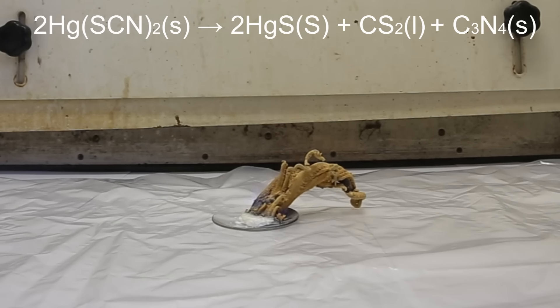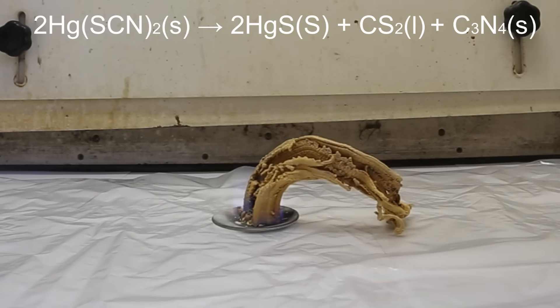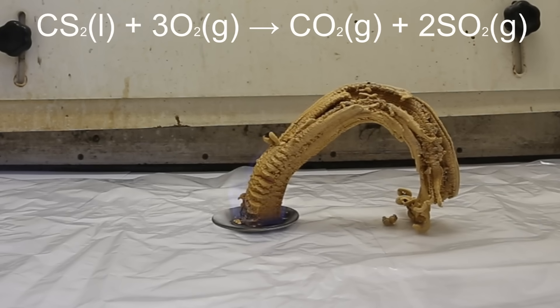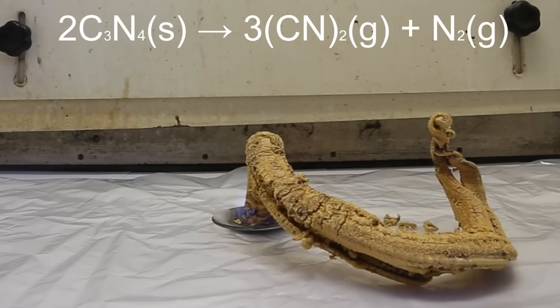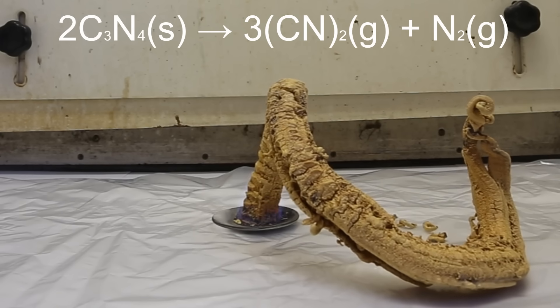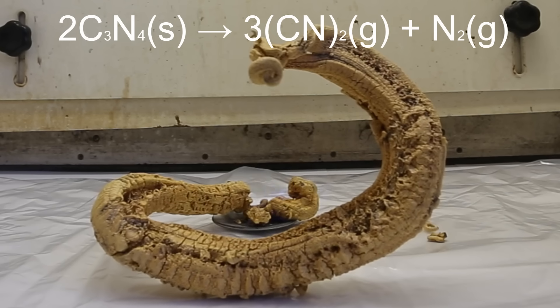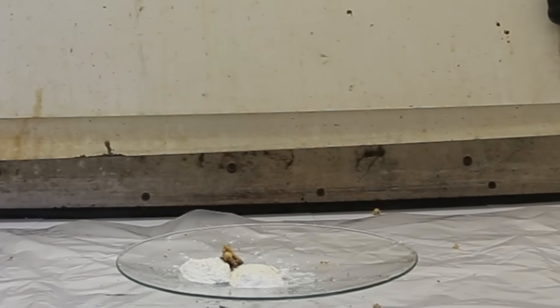Igniting the mercury thiocyanate causes it to decompose, producing mercury(II) sulfide, carbon disulfide, and carbon nitride. The mercury(II) sulfide readily reacts with oxygen to produce elemental mercury and sulfur dioxide gas. Carbon disulfide is extremely flammable, so the moment it is produced it reacts with oxygen to produce CO2 and SO2 gas. The carbon nitride is what the snake is primarily made of. Some of the heat will decompose the carbon nitride into dicyan gas and nitrogen gas — the nitrogen gas is inert, but dicyan gas is highly toxic as it can be readily reduced to form cyanide. This is the ignition of two piles with a total weight of a little over 20 grams, and out of all the reactions I have done with mercury thiocyanate, this one was the best.